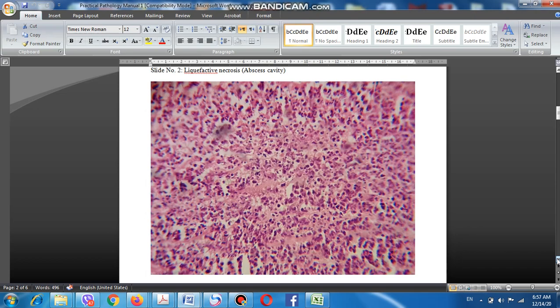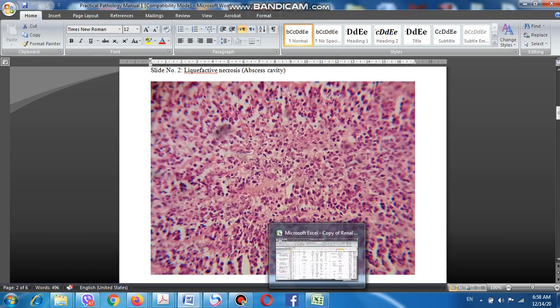The classical appearance of an abscess cavity results in pus formation. The abscess cavity is the cavity that contains pus. The classical appearance under the light microscope of an abscess cavity or pus is infiltration by a large number of neutrophils.